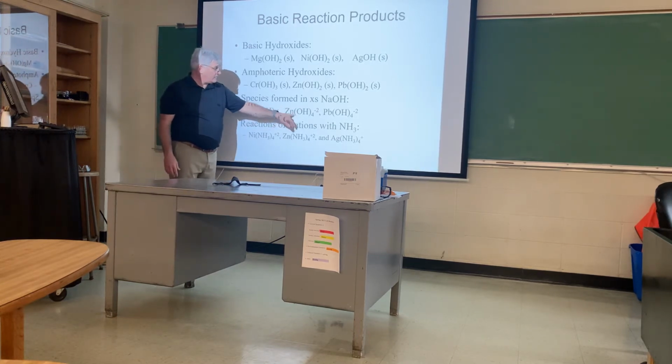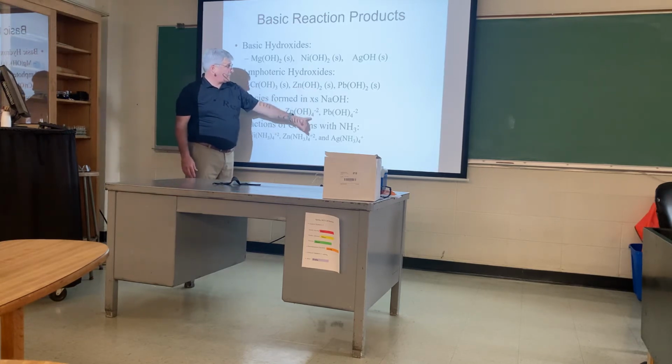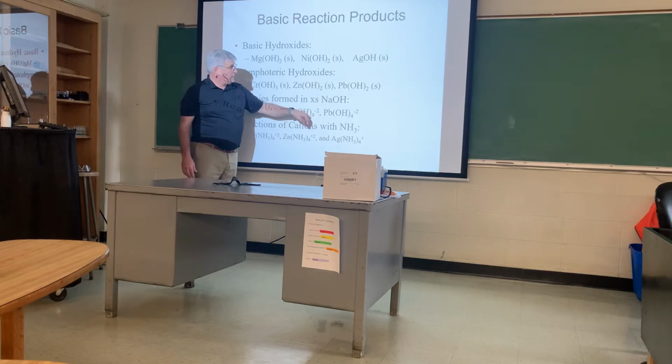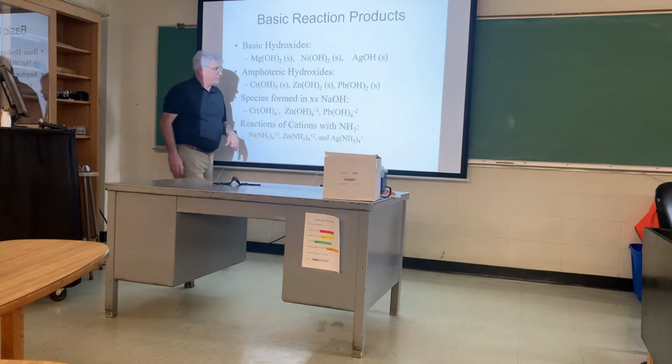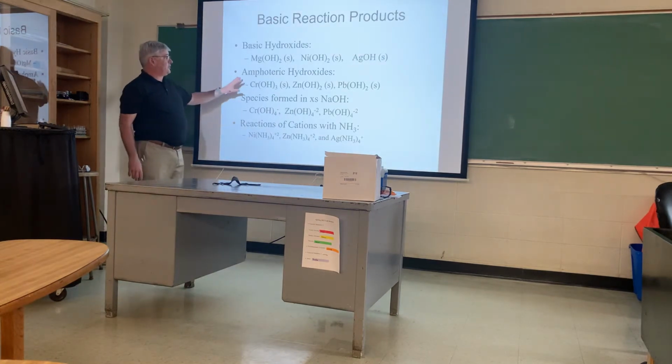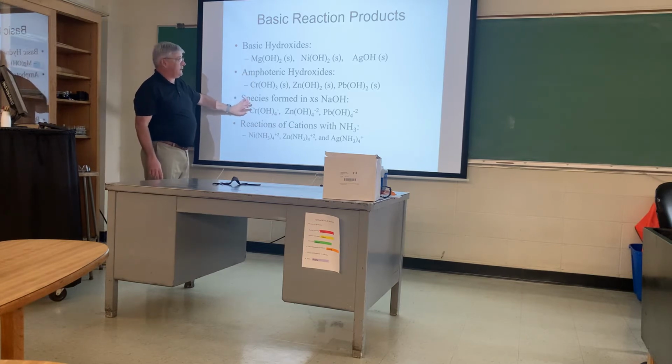The zinc hydroxide does the same thing. It goes from 2 hydroxides to 4 in its complex, and because it's a -2, as does lead in a similar reaction. So I can initially precipitate it out with a limiting amount of hydroxide and get the amphoterics to redissolve.